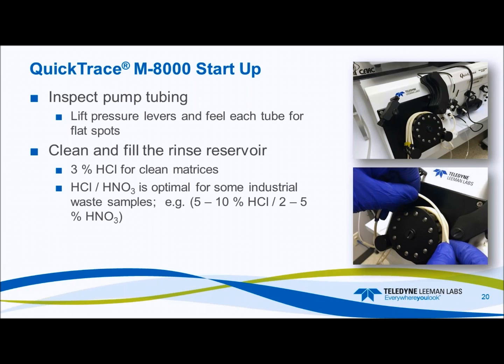Once you have your laboratory in control, it's very important to keep that logbook so you know when new chemicals are coming in, you know what pipettes and vessels and everything that you're using to create standards. It's very important to log those, serialize those products, so you know which one you're using each and every time you make up standards, because if you don't have that audit trail, when you find your system is out of control, you can be down for 2 or 3 days trying to source this contamination and to mitigate it so you can get your system back in control.